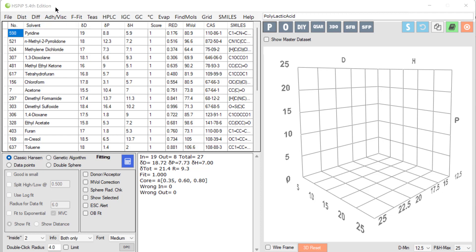In the previous tutorial we looked at how to measure the HSP of a polymer or a pigment or a nanoparticle. Now we'll try and use those values for complex formulation challenges.